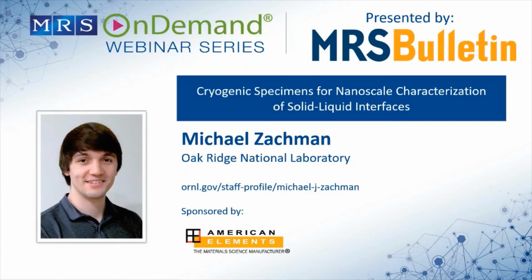And there are a couple of participants asking about when you're doing the FIB prep. Again, it's really a damage-related question, but what's the impact of the scattering of the ions? Does it cause local heating? Does that result in decomposition in the liquid electrolyte? Right. Any comment on that?